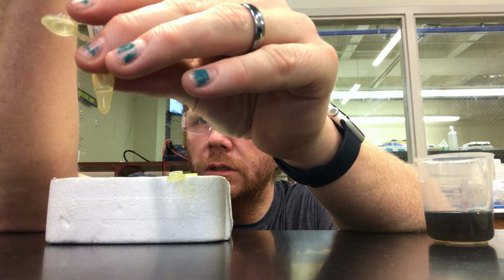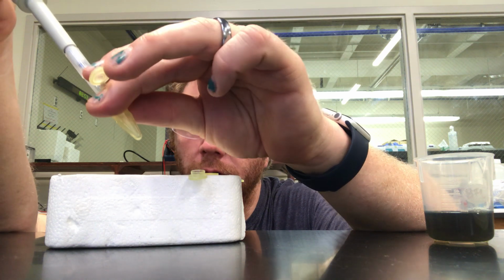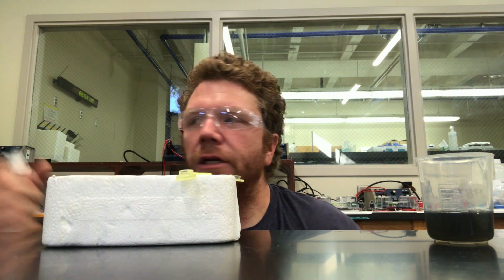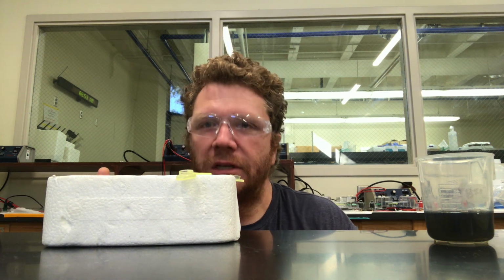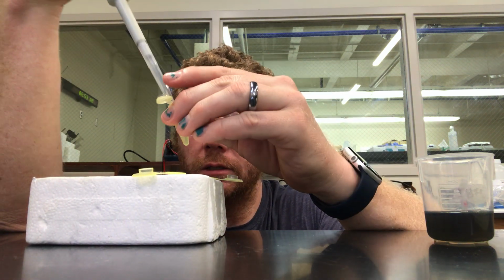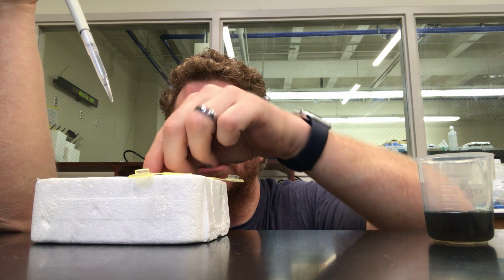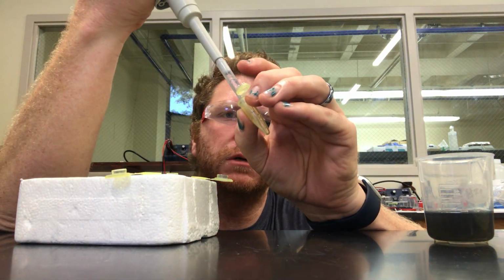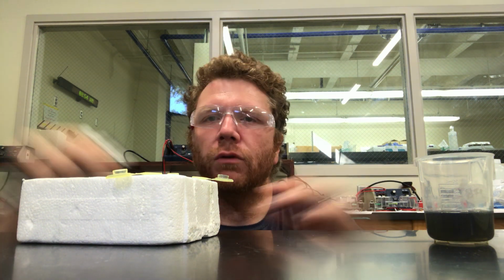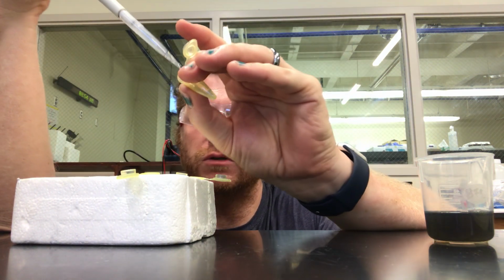So I'm going to take 100 microliters out. I'm going to put that into my second microcentrifuge tube. Now in that second microcentrifuge tube, what I need to do is then get 100 microliters of deionized water. Transfer that into here. Thoroughly mix the contents of the second microcentrifuge tube, take 100 microliters out, and add it to my third microcentrifuge tube. Now again, get 100 microliters of deionized water, and add it to my third microcentrifuge tube.